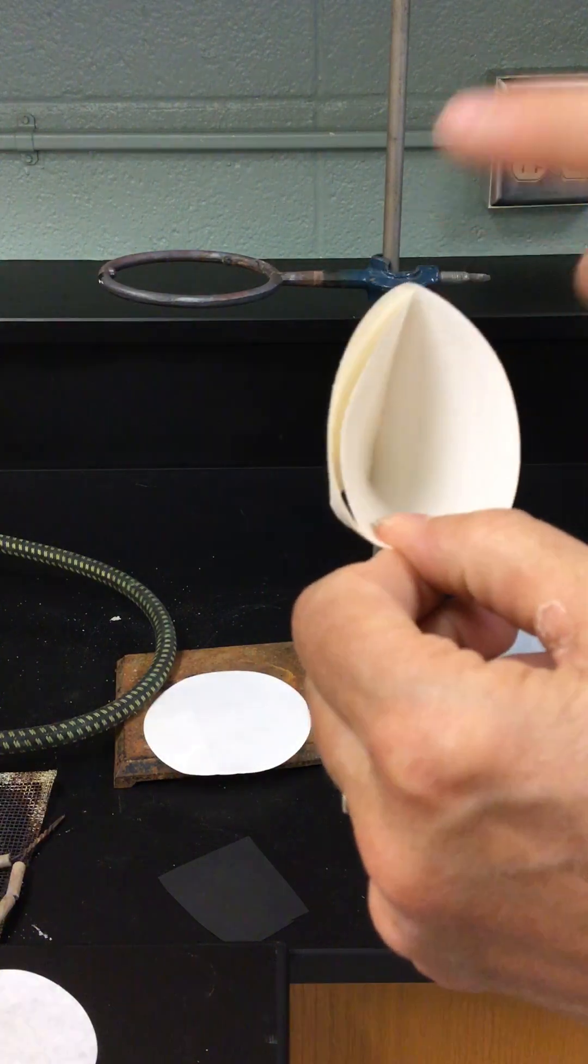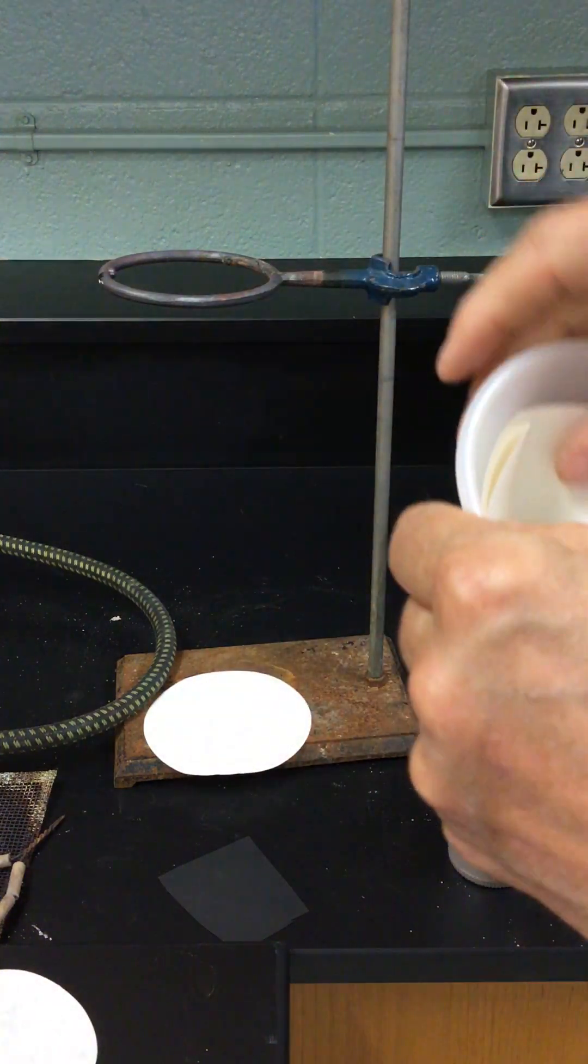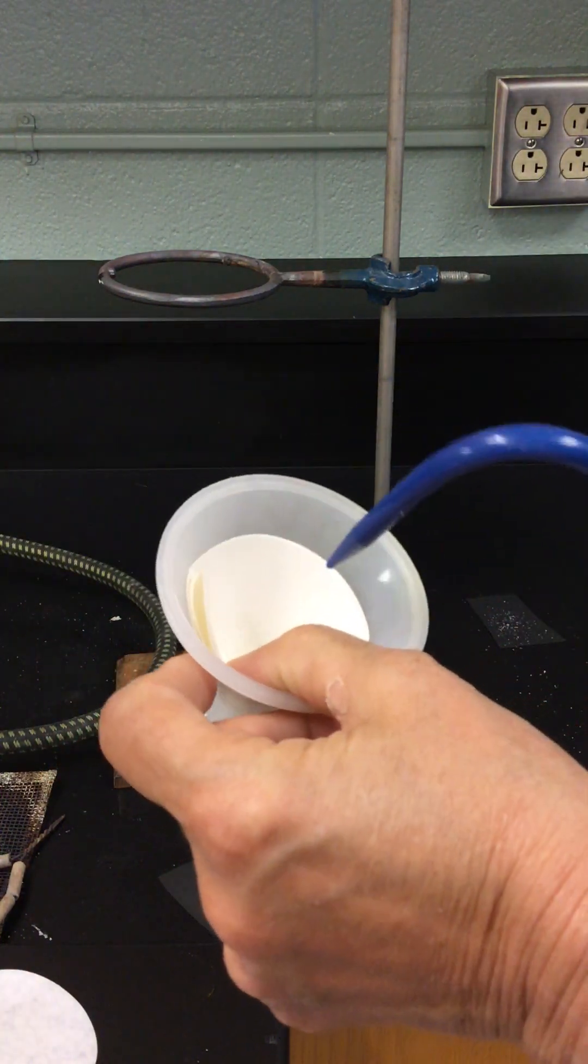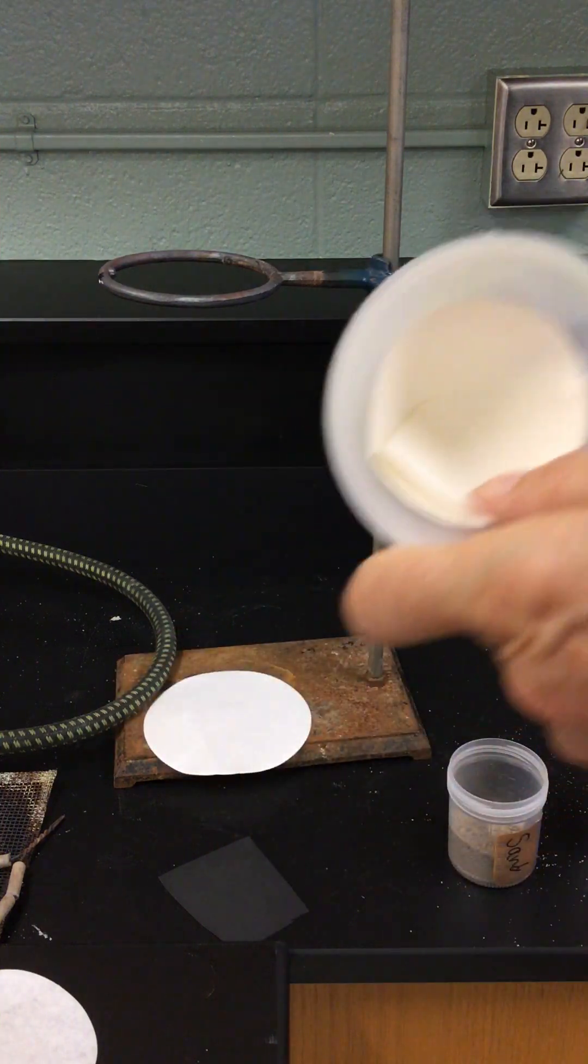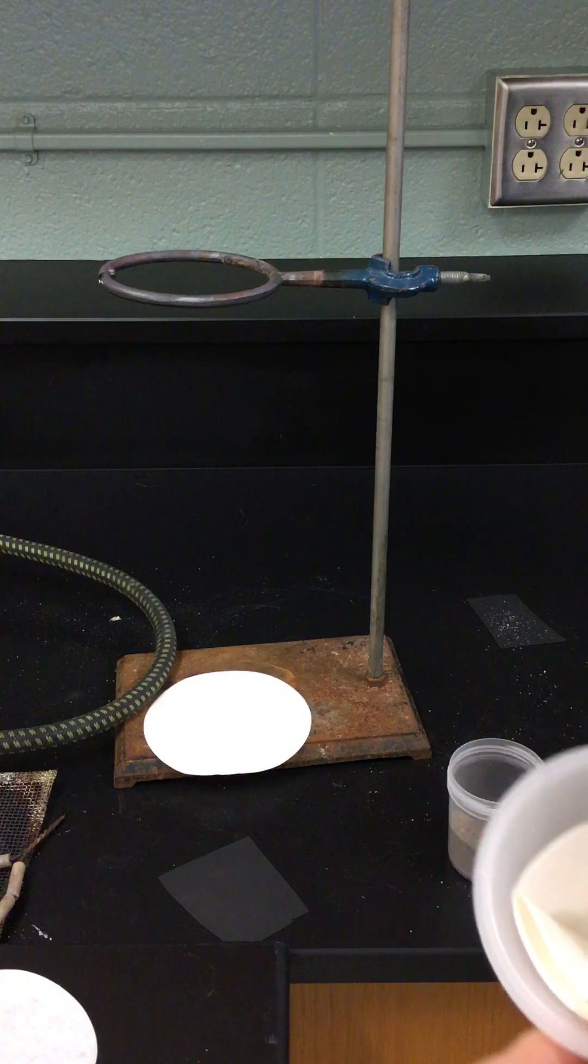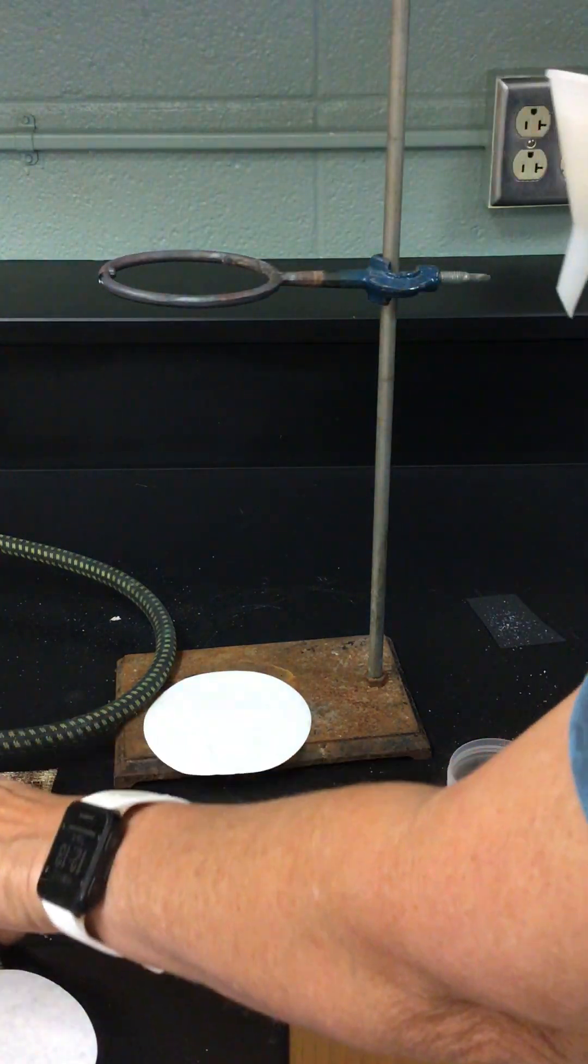We prepare a filter like this: we fold it in half, fold it in half a second time, we open it so that there's one piece of filter paper on one side and three on the other, place it into our filter. I usually hold it down and make it stay in its spot by giving it a little squirt of water.